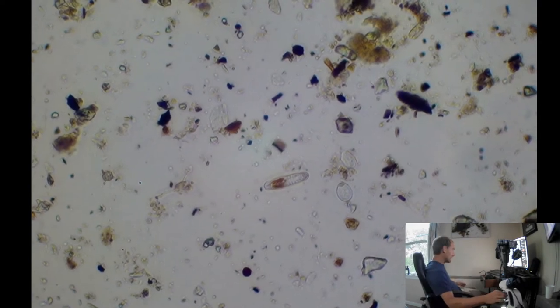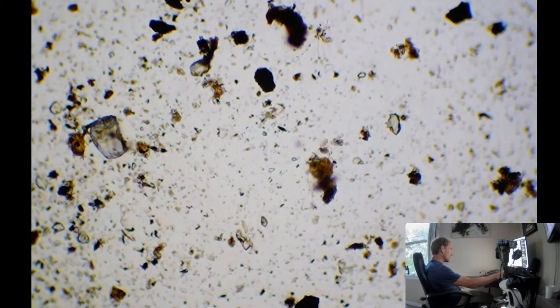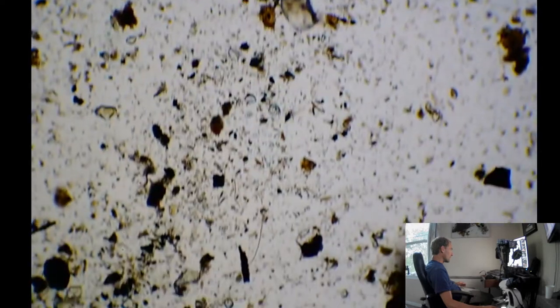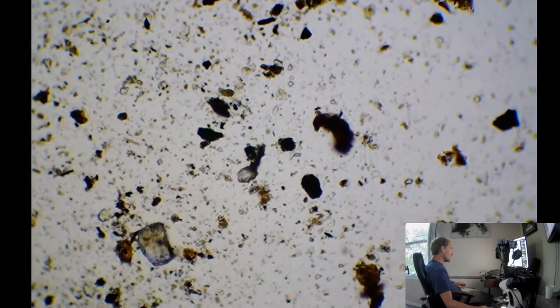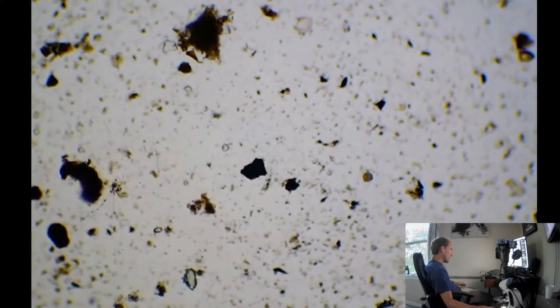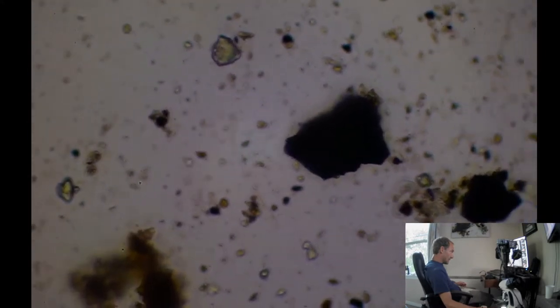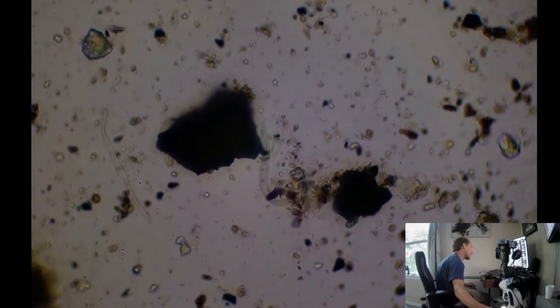But where'd our nematode bounce on us? Where'd he go? Where did you go? Sometimes they're quick. I don't see him. Is he just still? Aha! There he is. Alright. That's pretty centered. Oops, wrong way. Quick! Oh, there he is! And there we have it. There's the nematode. Exactly what you want to see in the soil.